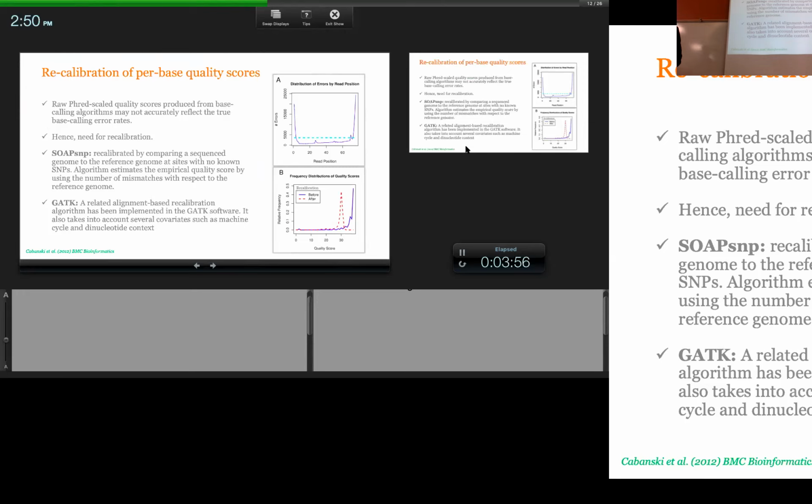Well, everywhere in the genome where you sequence a CCC is going to automatically have a lower quality score, not because it's wrong sometimes, but because you feel you're not confident calling that. Well, what if the actual sequence was a CAC?